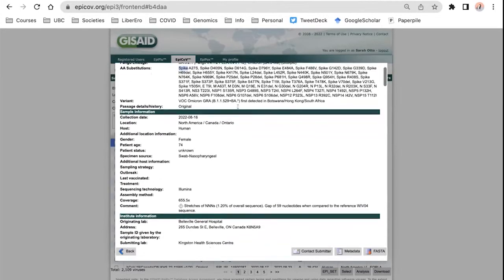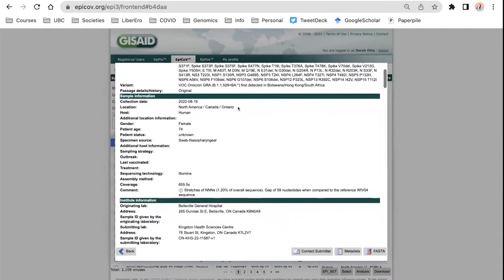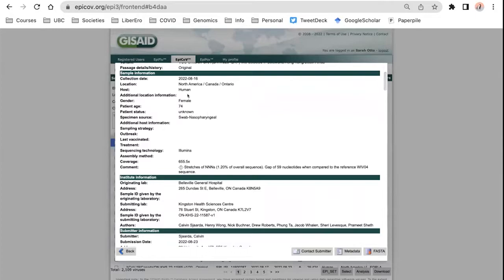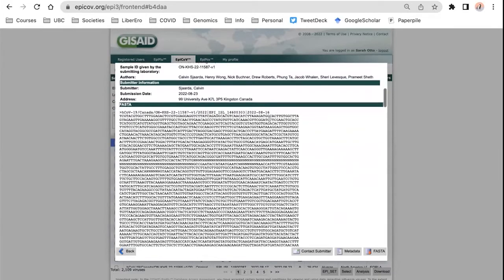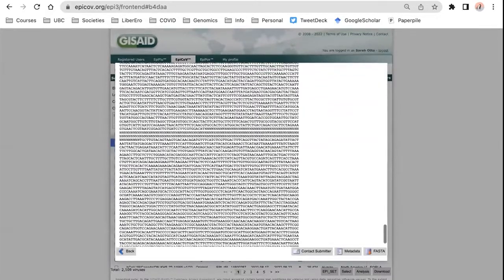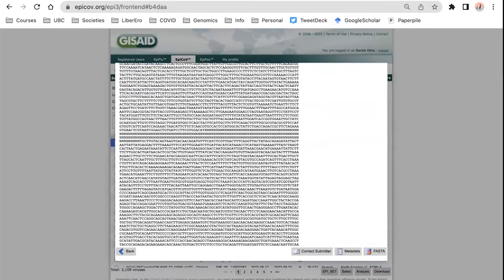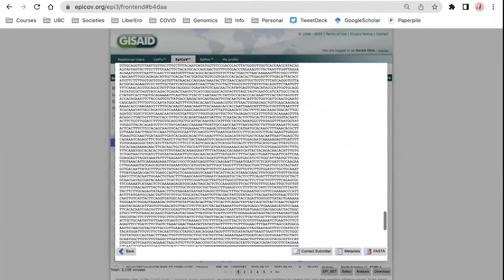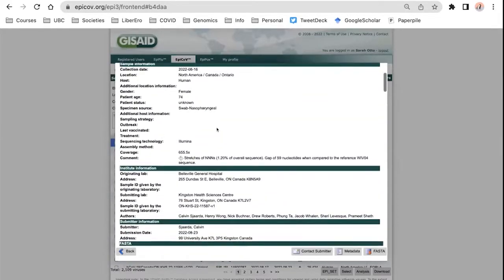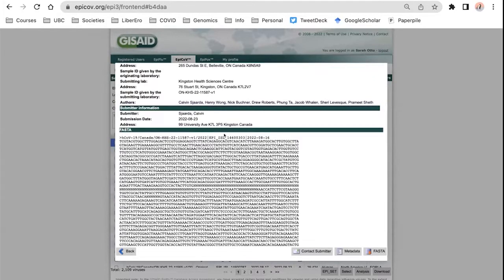So it tells you information like what amino acid changes it has, where it was collected from — this one's from Ontario, from a female of age 74. It also gives the actual sequence in the ACTGs of the 30,000 base pairs, which you can download and analyze if you want. The ends are places where it was unable to characterize that sequence. This is a pretty good one — not too many ends and lots of information.